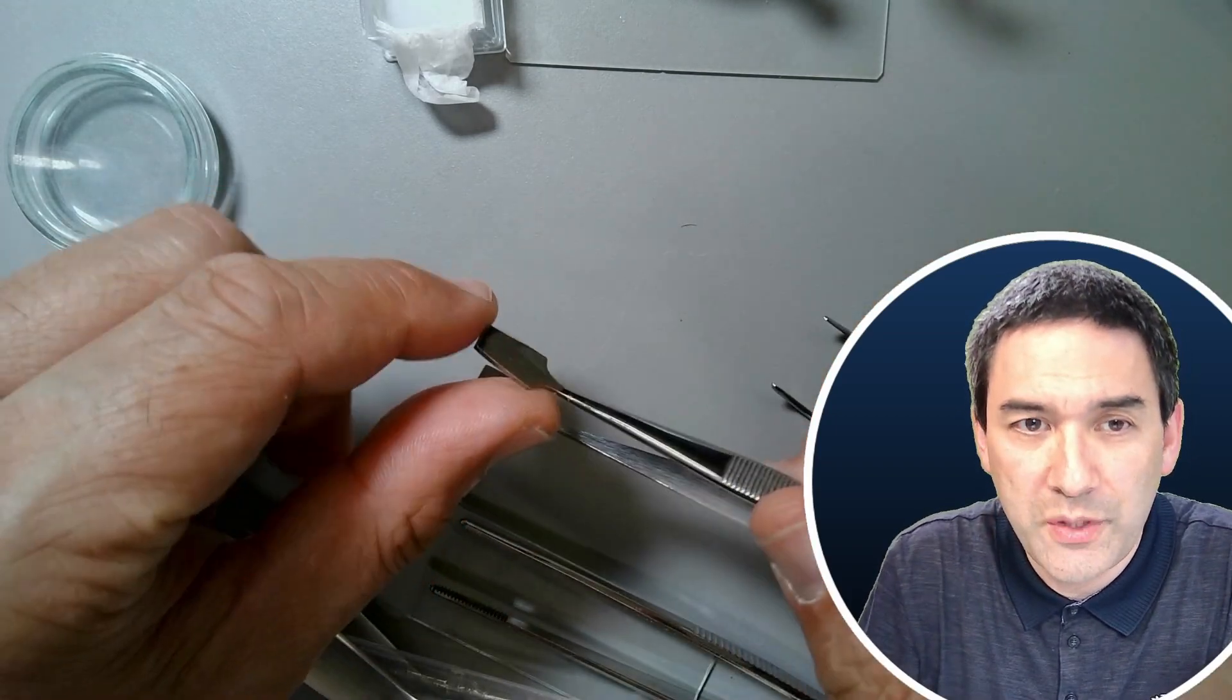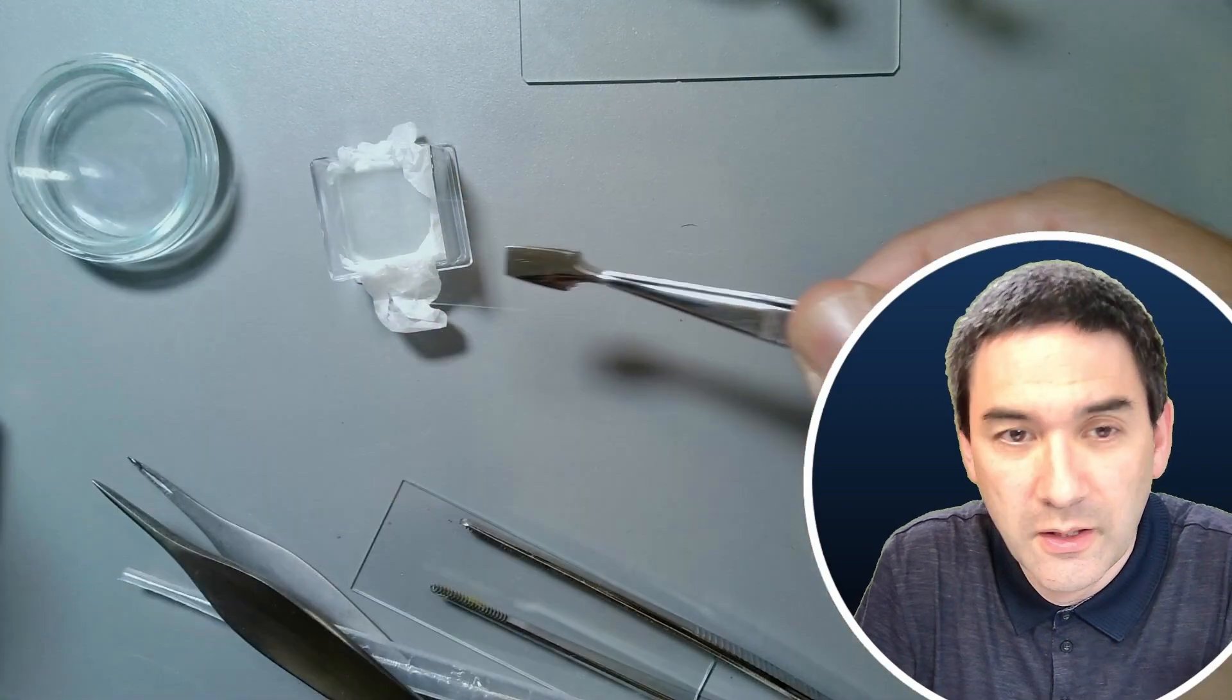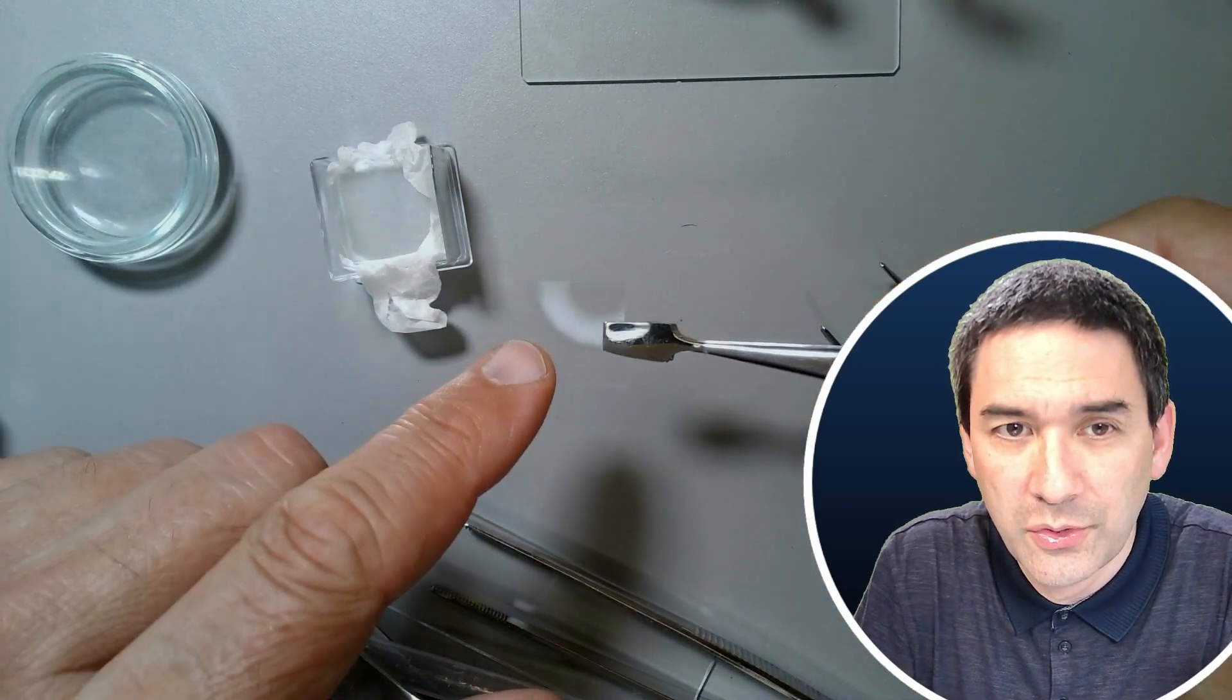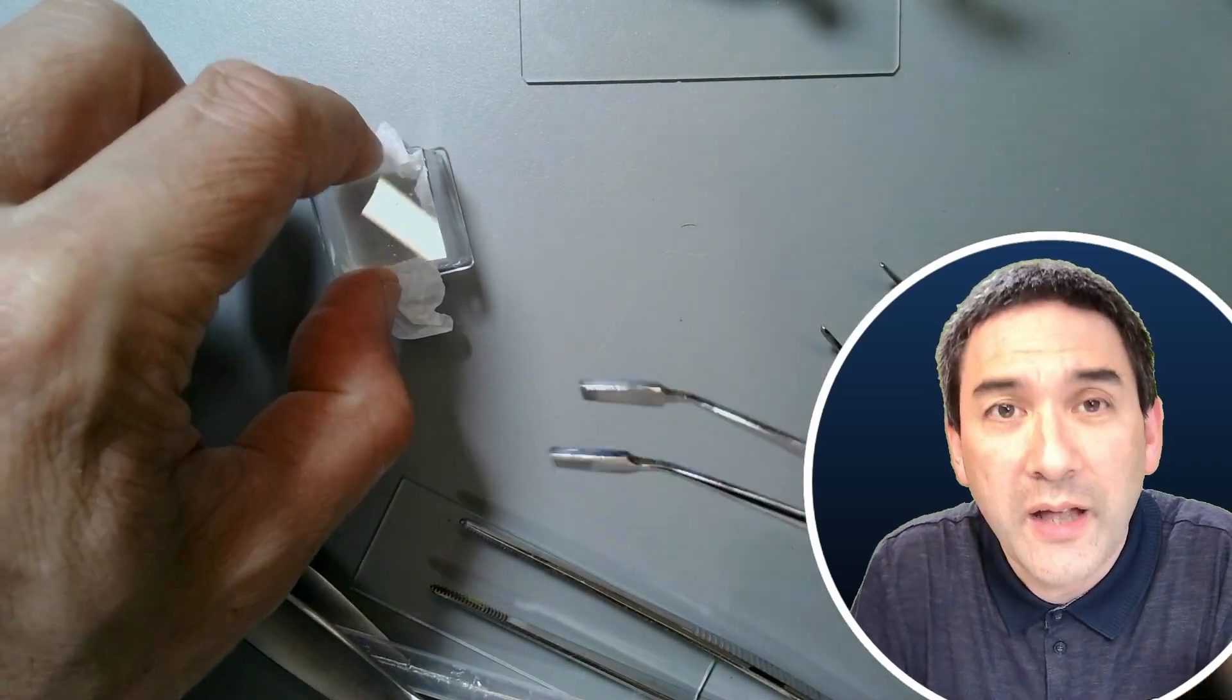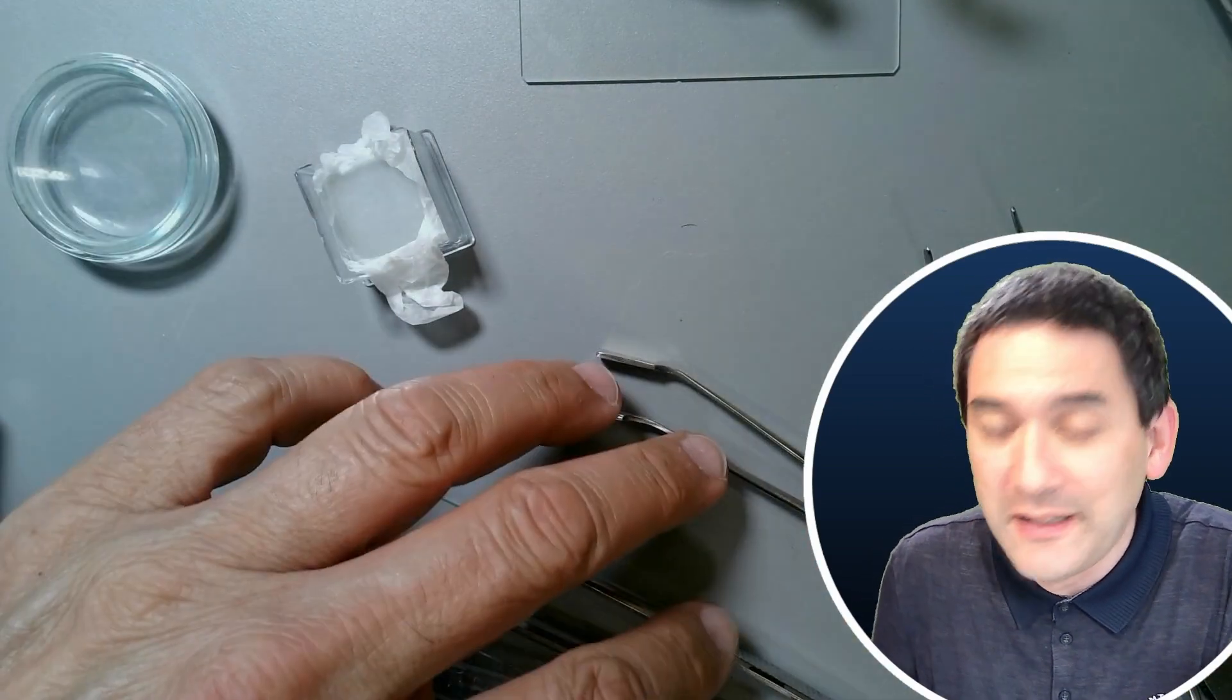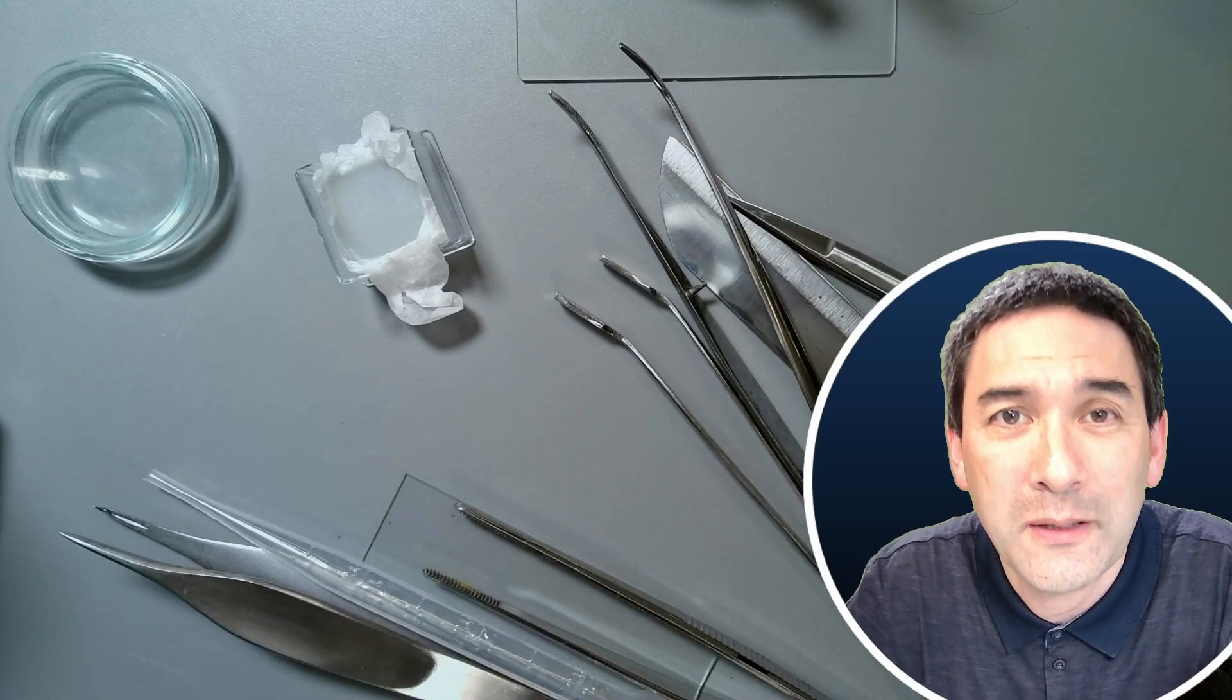Look at these tweezers here. They are actually used to hold those cover glasses as well, but I rarely use those. I think you get the point. I wanted to just give you a short overview of what is available out there.